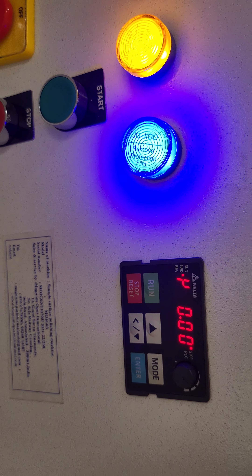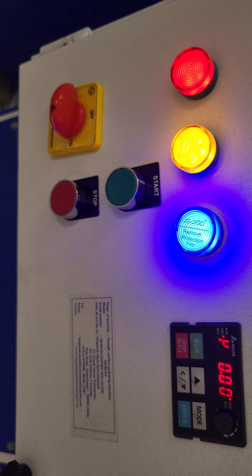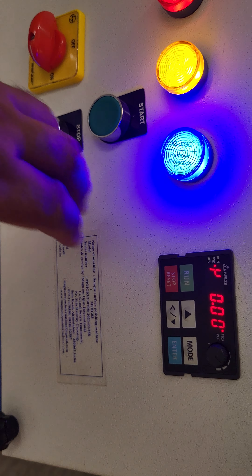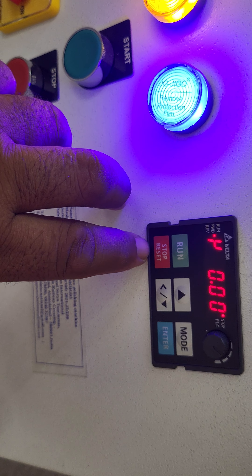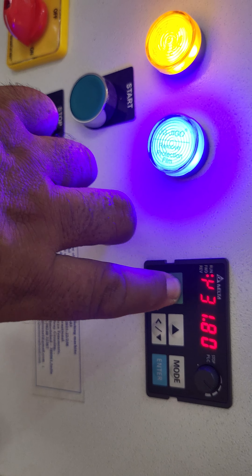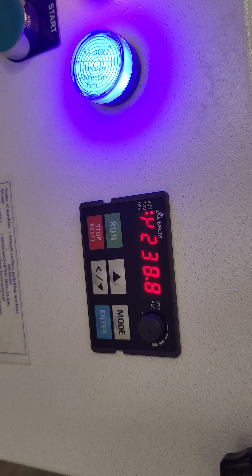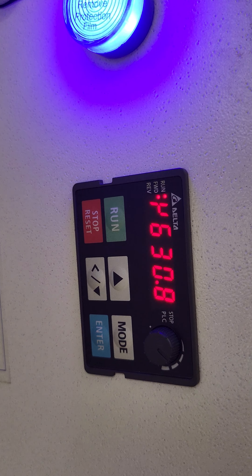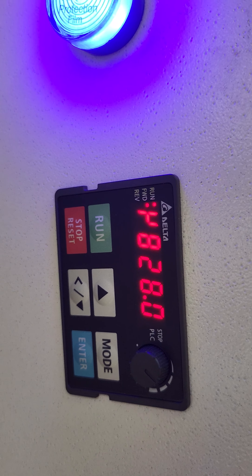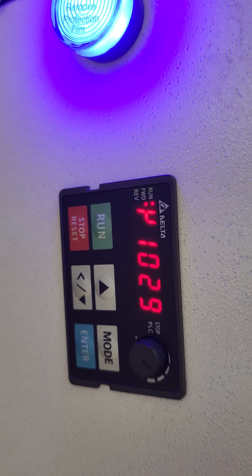Once switched on, you will see figures on the front panel display. For starting the main motor, the green button is to start and the red button is to stop. Once I push the green button, the main motor starts and you can see the varying RPM on the display.